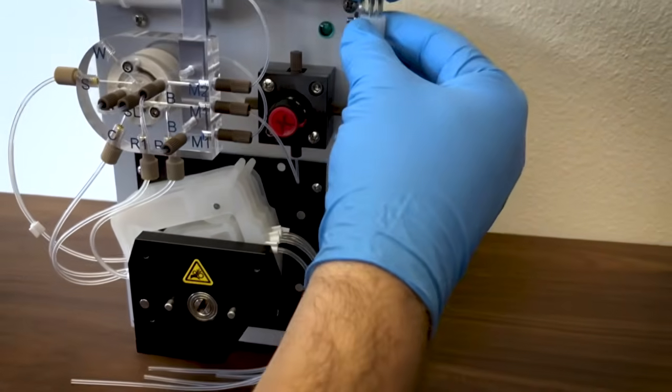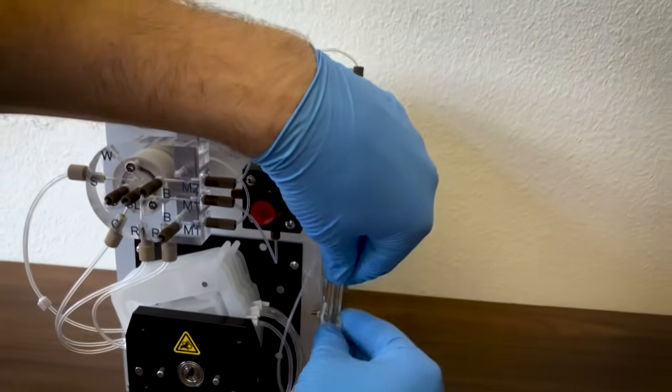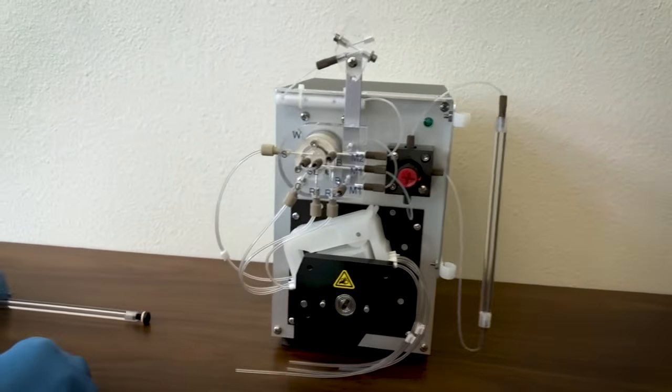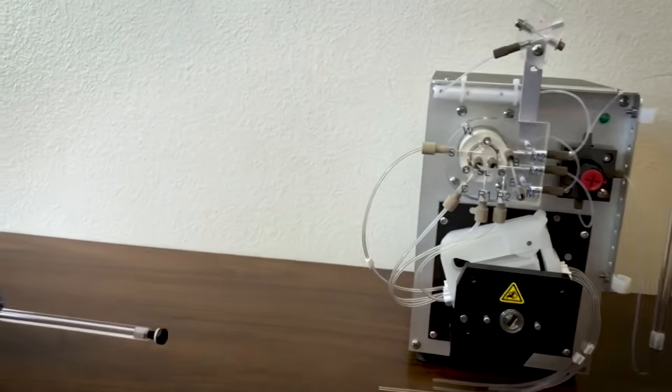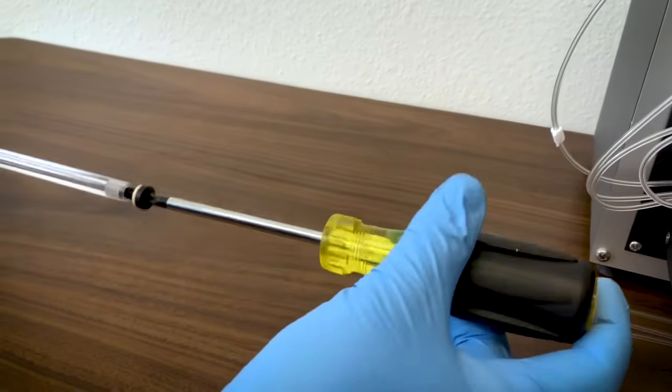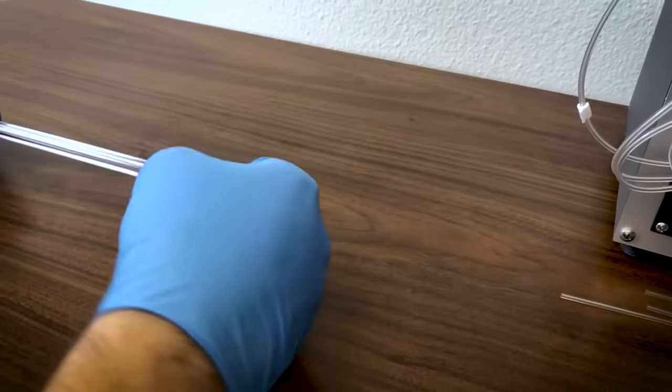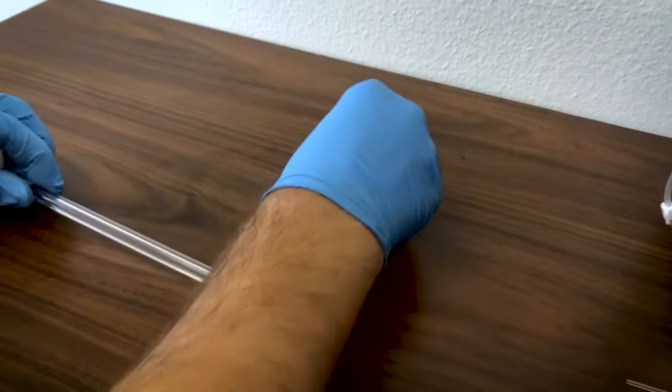Remove the column from the clips. On the new column, remove the plug from one end. The caps on the ends are screwed in very tight, so you may need a screwdriver to get them loose. Try to keep the column level to avoid any buffer leaking out.